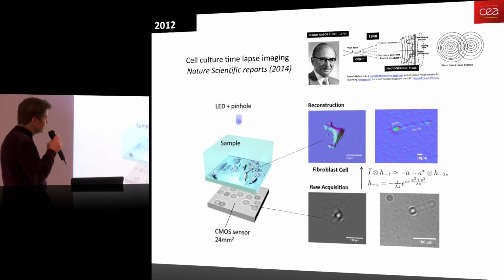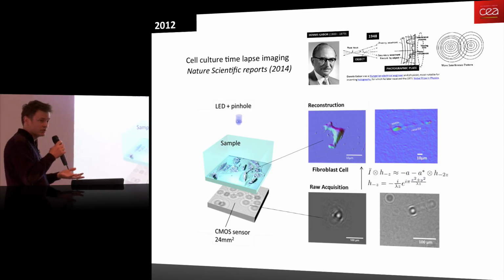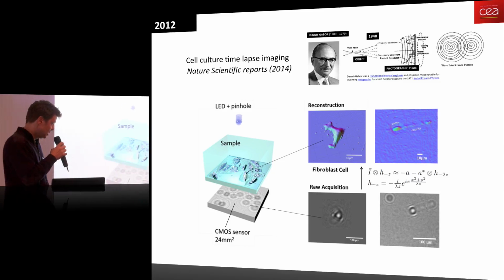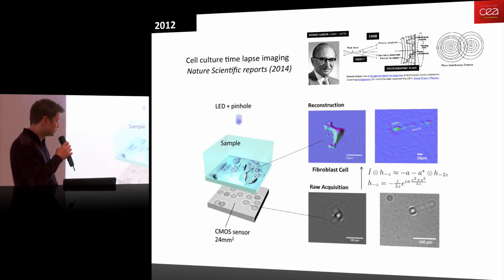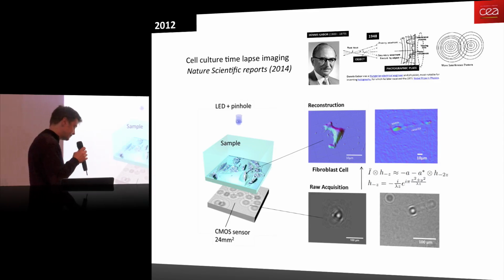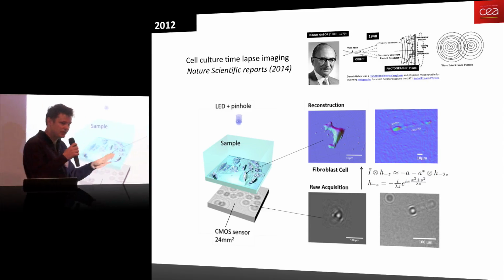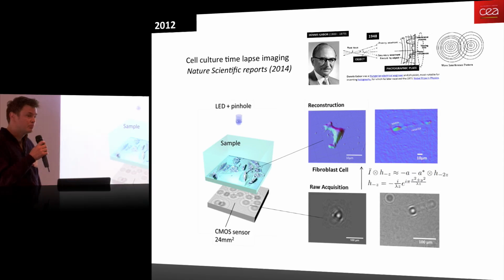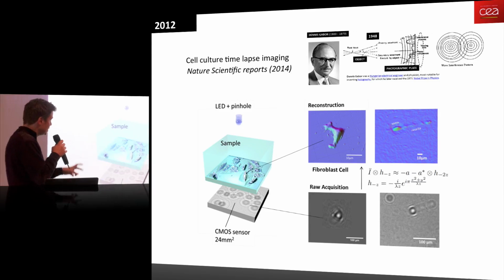And then in 2012, we have been looking at cells. And now cells are much larger, and we want to make a picture of the cells. Before, we could only detect the object, but we could not make a picture of the viruses. We cannot make a picture of the bacteria. But with the cells, we want to make a picture. And with the cells, we are not using the soap anymore. We are not using the polymer from the e-cigarette anymore.